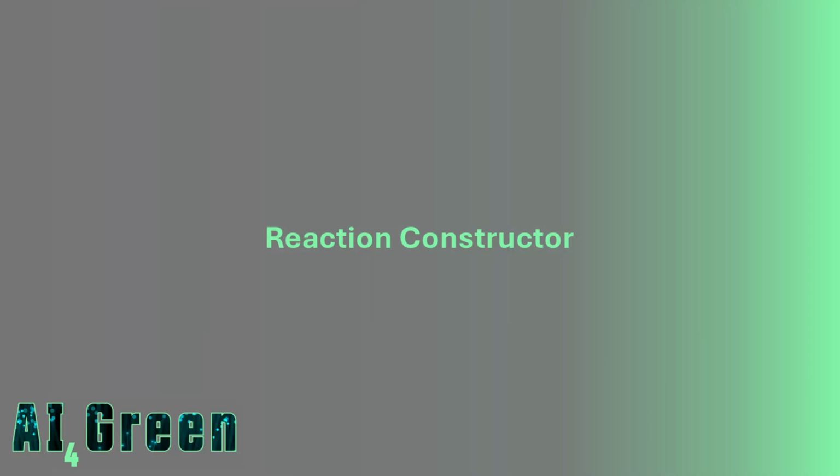Hello and welcome to a demonstration of how to make a reaction in the AI4Green web application.